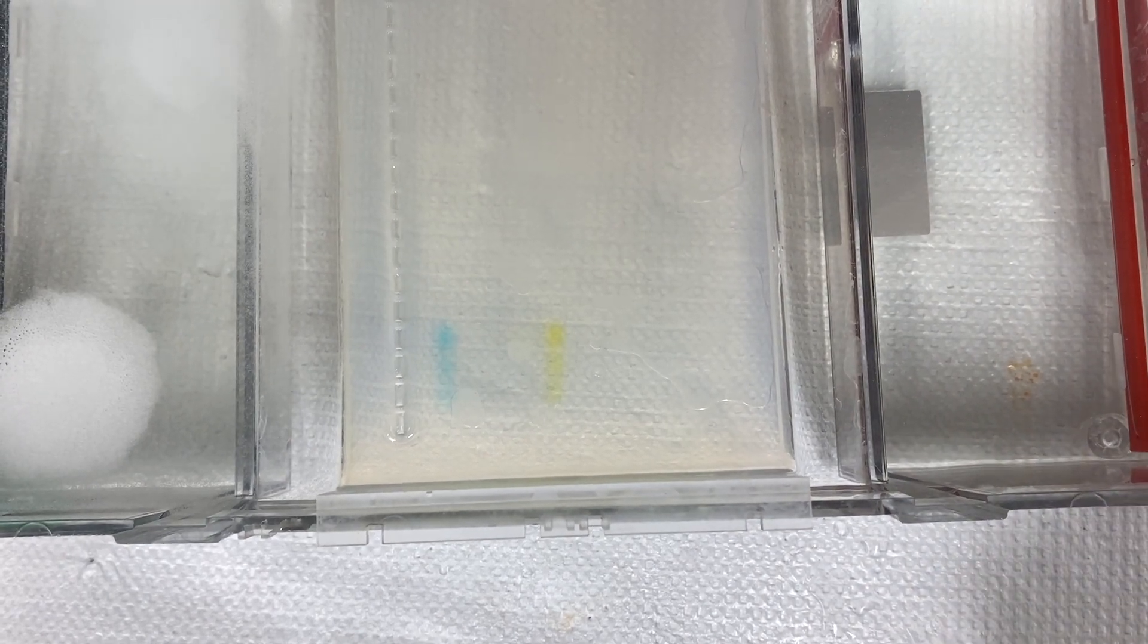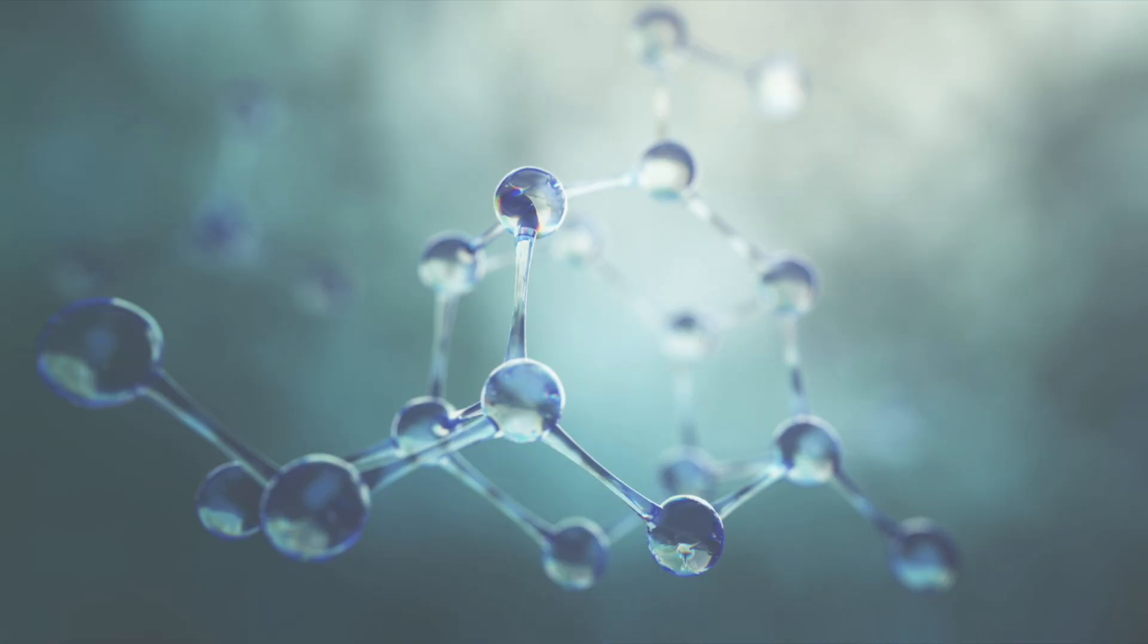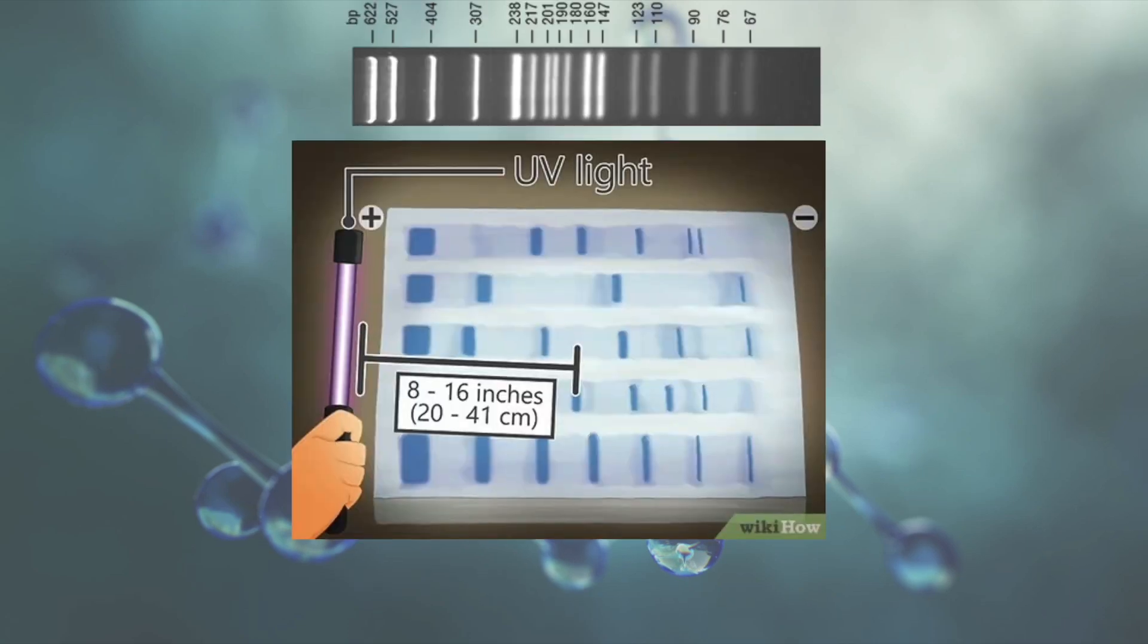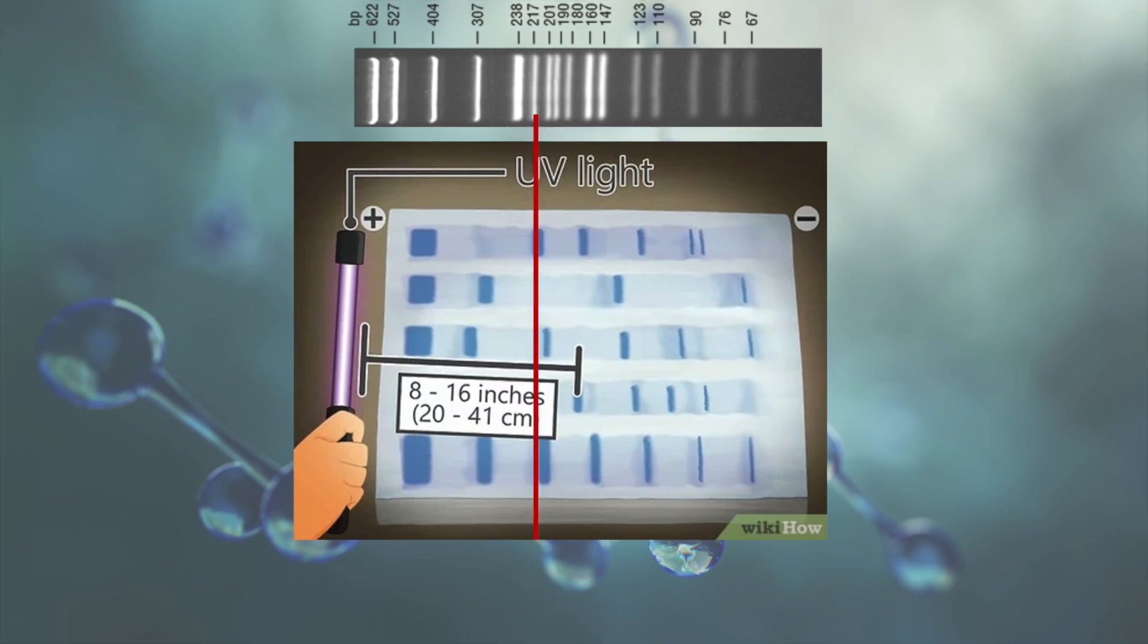Now at this point you might be thinking, okay, I see some lines, but what does that mean? The bands don't actually mean anything on their own, but when you add a UV light and compare it to an identified set of DNA, referred to as a ladder, you can make conclusions about what the genes you are looking at actually are.